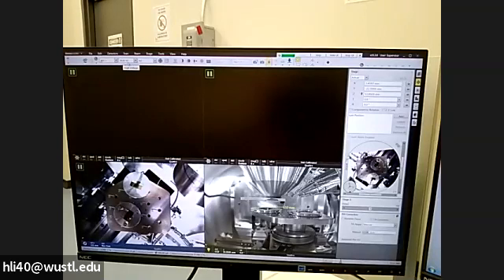The accelerator voltage is good to choose in the beginning. You can change it during the session. So for example, if you're working on a material which may have charging, you want to start from a voltage a little bit low before you move up. So with time, you will know which voltage is best for your sample.